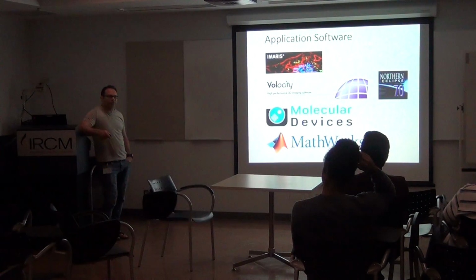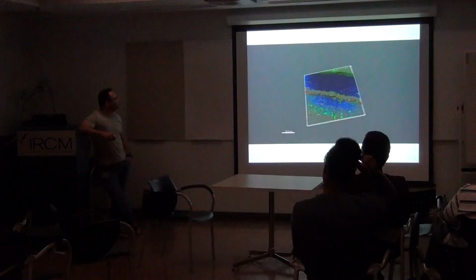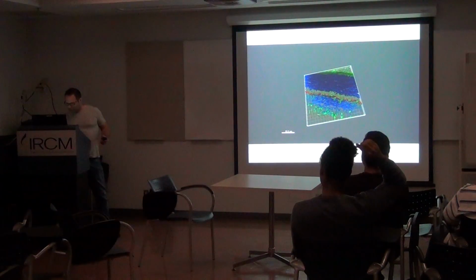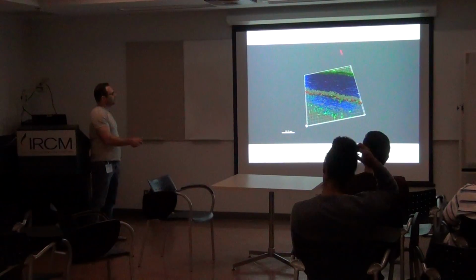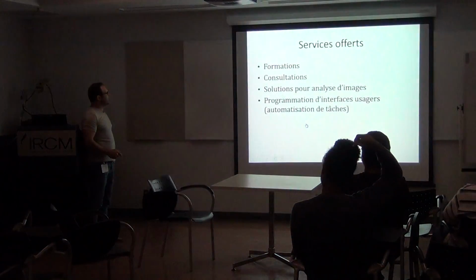And I can show you also how to use MATLAB to program. It's really nice. And maybe this is the video. That's 3D that you can produce with Imaris.